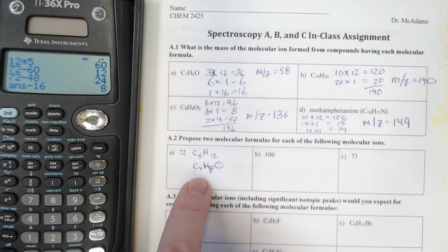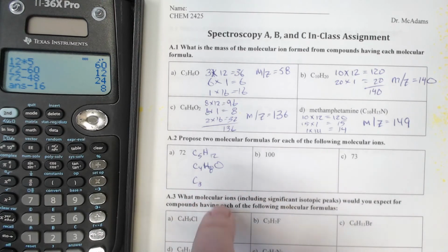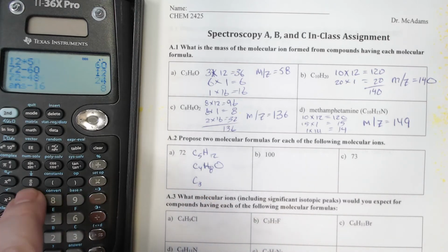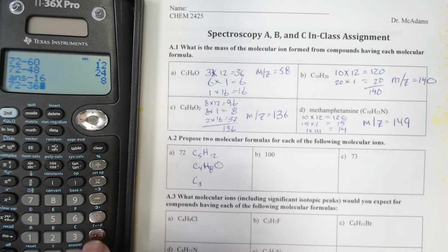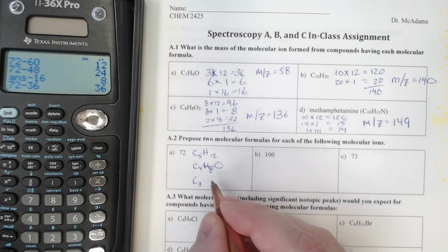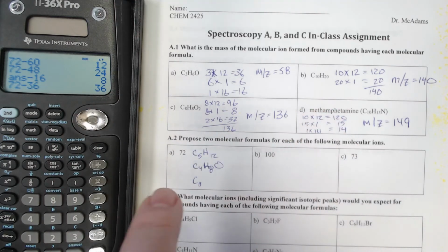All right, so now let's look at the possibility of C3. 3 times 12 is 36. We're going to subtract that, so 72 minus 36 means we have 36 left to work with. If we did 1 oxygen, we would have 20 hydrogens. That's probably not going to work.